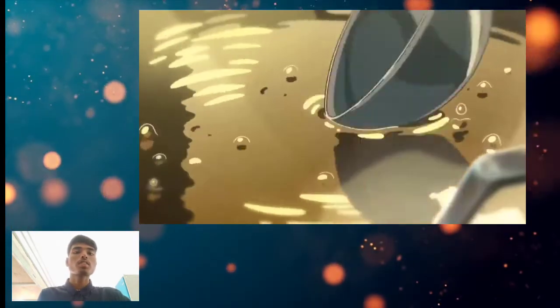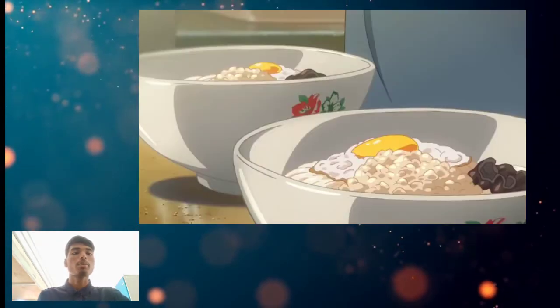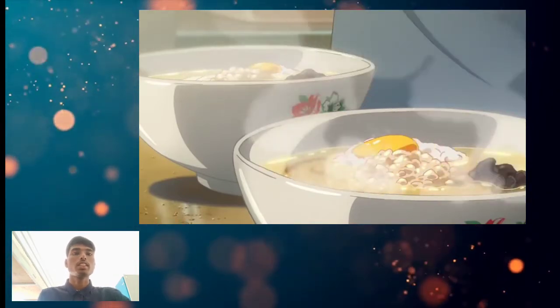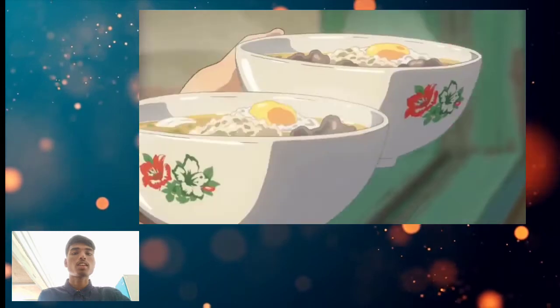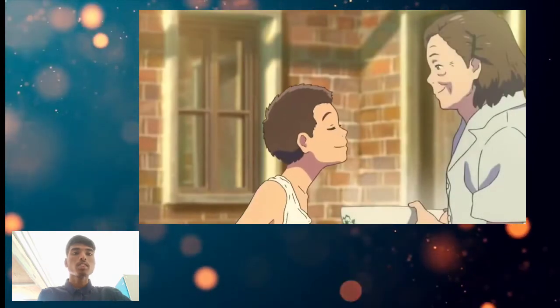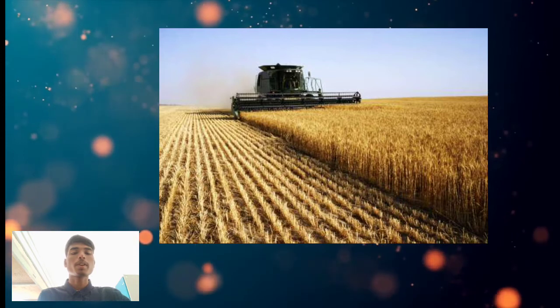As we take a closer look, the presence of pesticides, antibiotics and aflatoxin in food becomes a big reason for HPLC's involvement in this industry. First and foremost, pesticides are substances used to destroy pests, so this will maximize the crop yield by keeping the pests away.